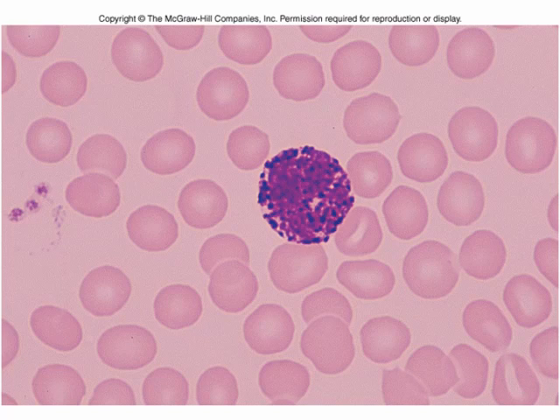Here's another view of a basophil. This comes from your textbook. Again, you can see the little dark granules in it, so much so that you hardly even notice the nucleus. If it looks speckly, that's how I tell my students, if it looks dark, speckly, like it's got freckles all over it, that's probably going to be a neutrophil. Excuse me, I said that wrong. If it has freckles all over it, that's going to be a basophil.